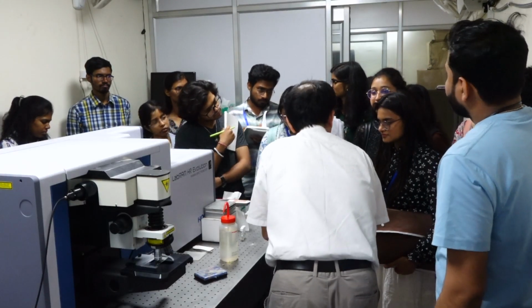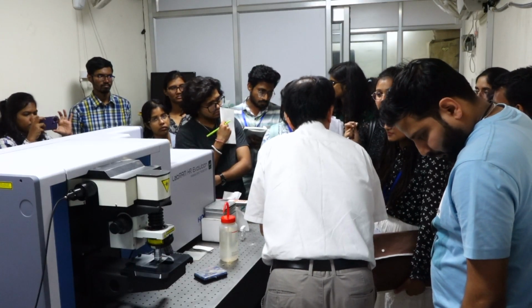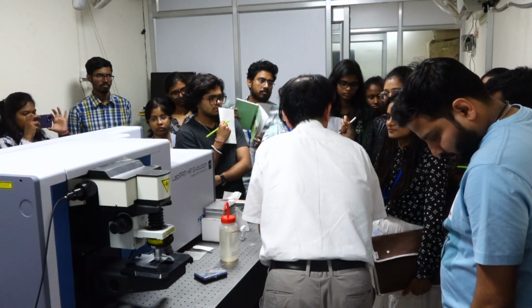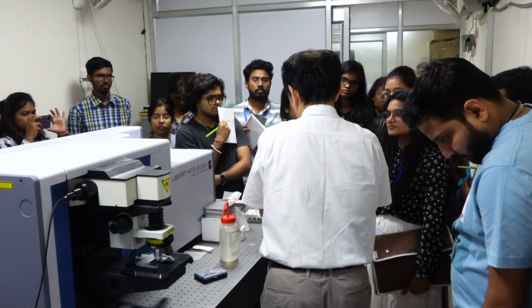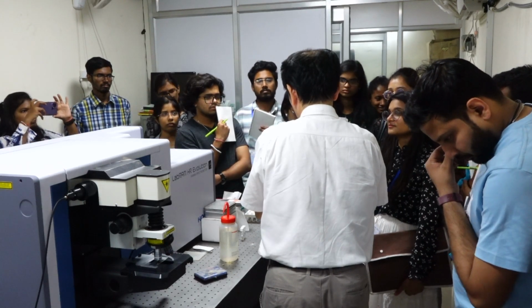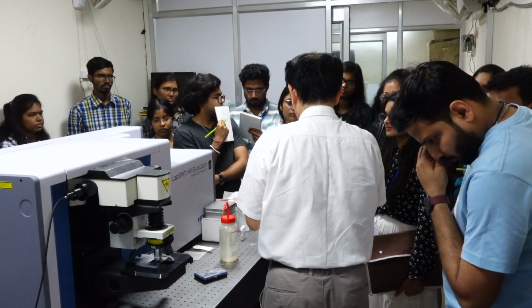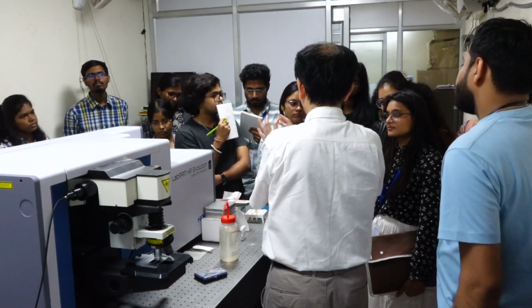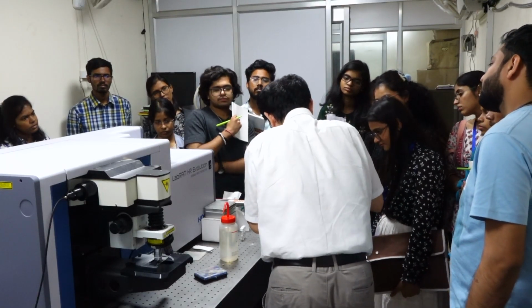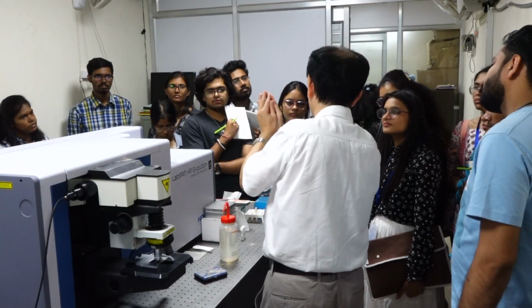If the thickness of the sample is very thin or very thick, it will also affect the intensity of the Raman spectrum. Actually, Raman signal is generated from the focal point. If we see from the top, it looks like a focal point, but in 3D, it's a focal volume.